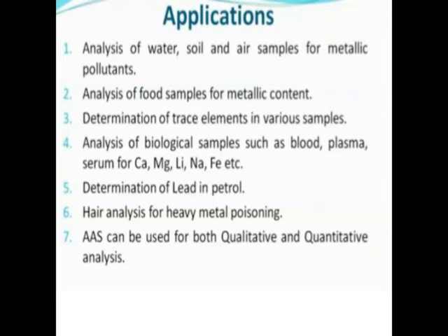So we are moving to the next part, the applications of atomic absorption spectroscopy. The applications of flame photometry and this one are nearly the same. What are the applications of atomic absorption spectroscopy? The first one is that we can analyze water, soil, and air samples for metallic pollutants, or elemental pollutants which are present in the soil, water, and air.